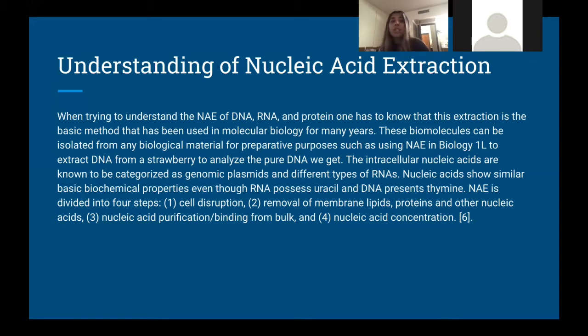Nucleic acid extraction is divided into about 3-4 steps that were mentioned before: cell disruption, removal of the membrane lipids, proteins and other nucleic acids, nucleic acid purification and binding from bulk, and lastly, nucleic acid concentration.